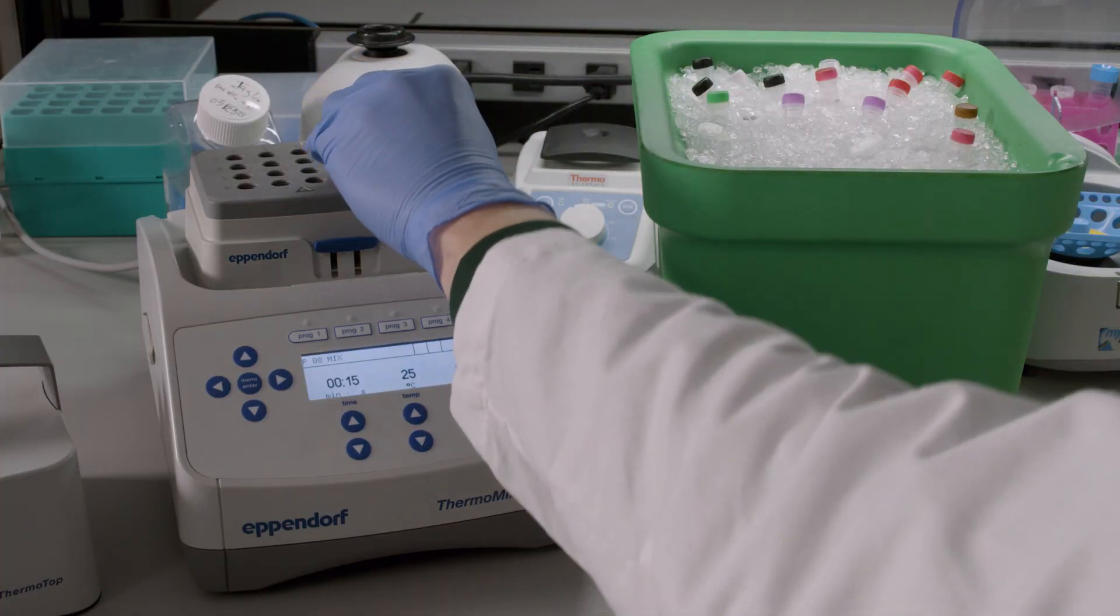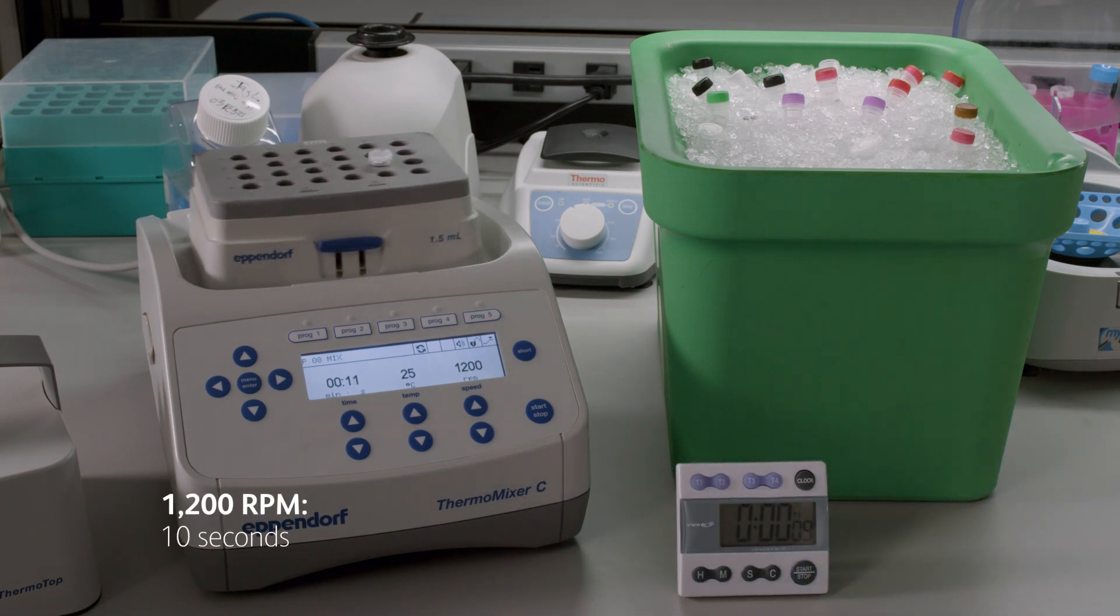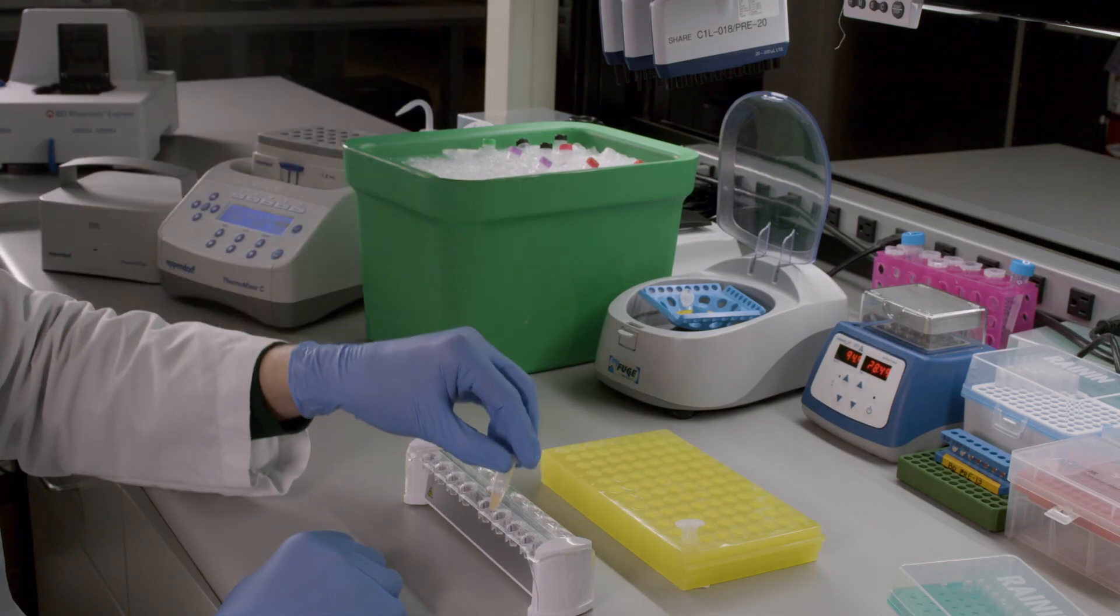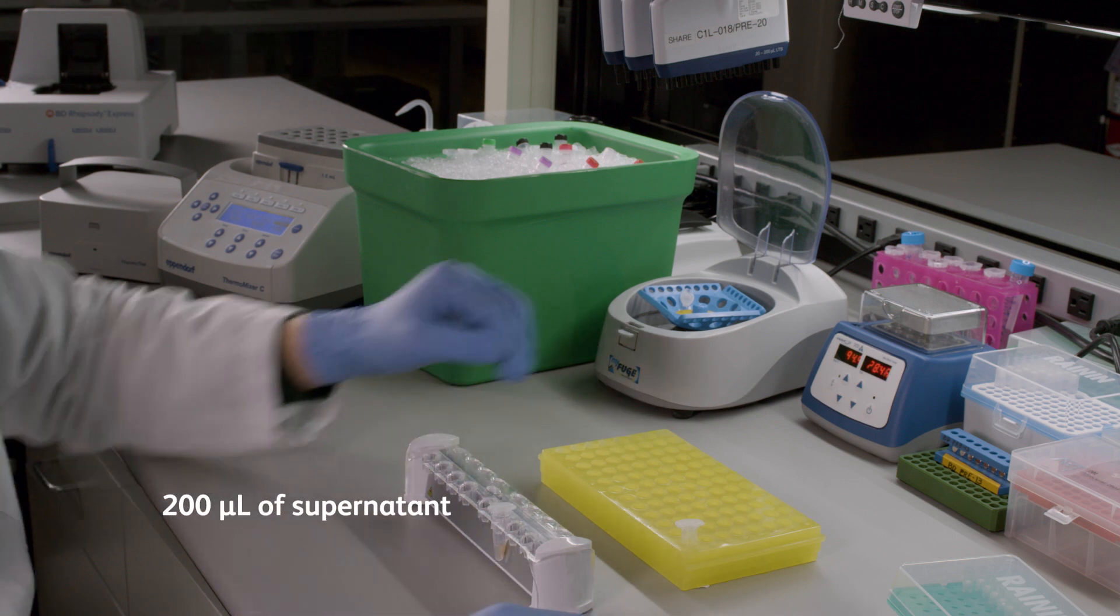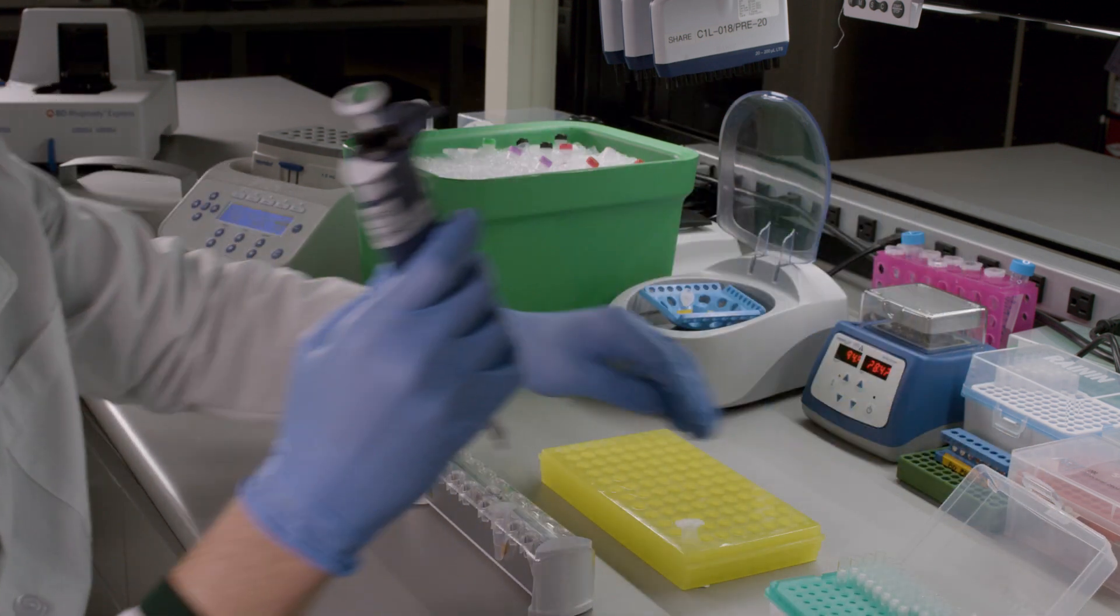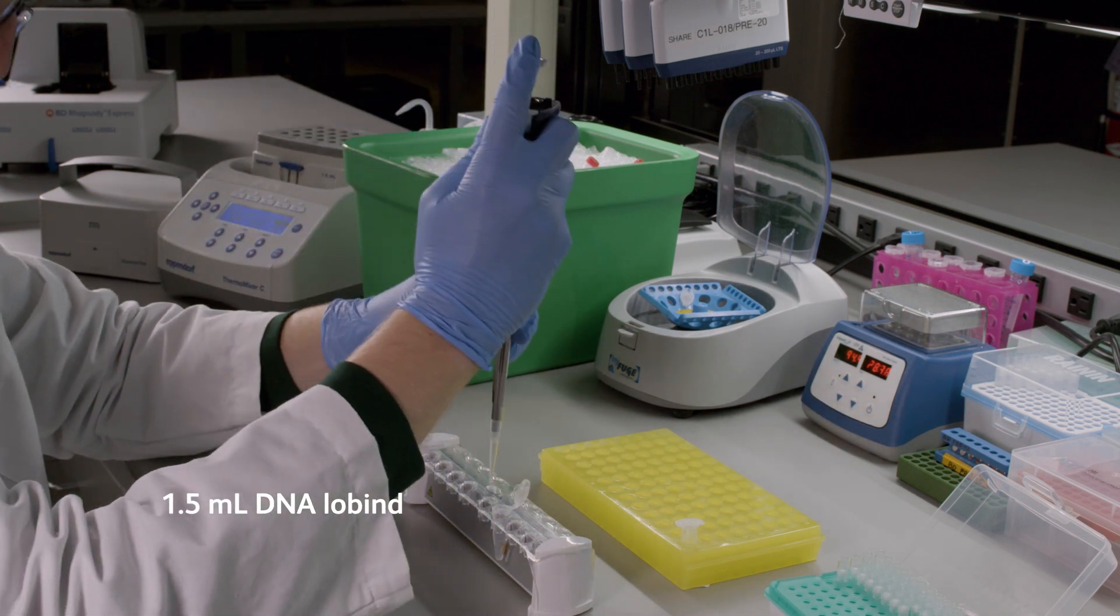Next, briefly shake the tube on a thermomixer set at any temperature at 1200 RPM for 10 seconds to resuspend the settled beads. Then, place the tube on a magnet and wait 30 seconds for the beads to bind. Immediately transfer 200 microliters of the supernatant containing the RPE products into a newly labeled 1.5 milliliter DNA low bind tube and store on ice.